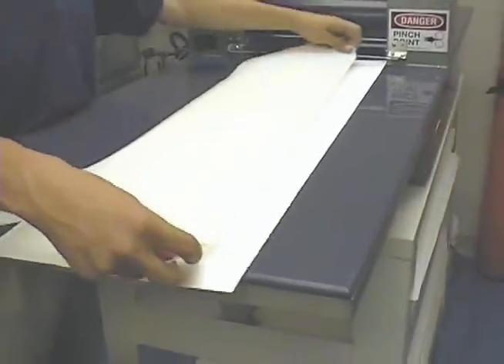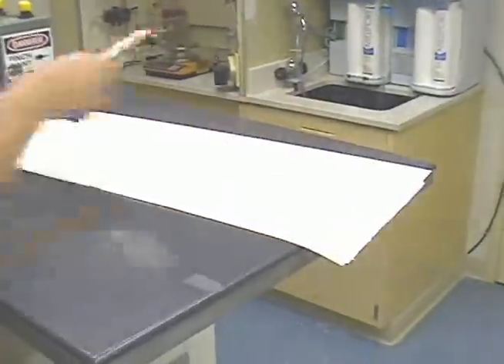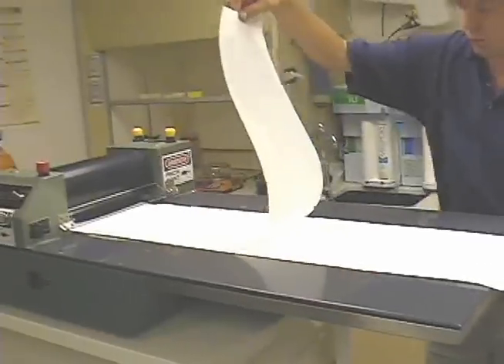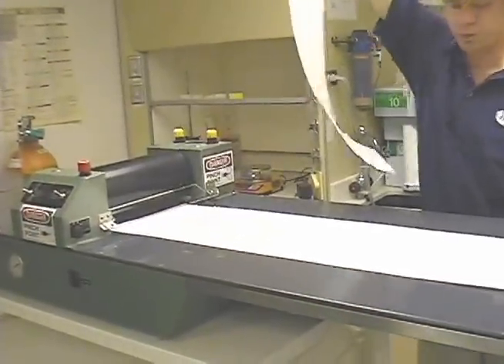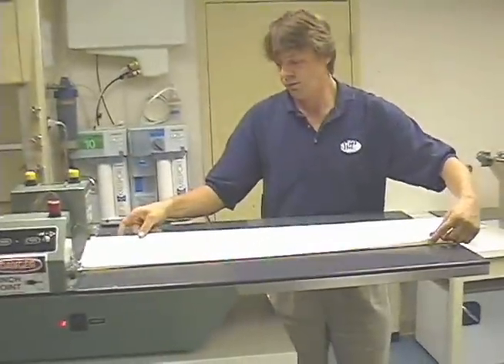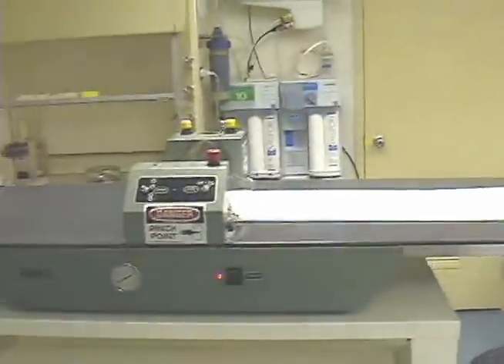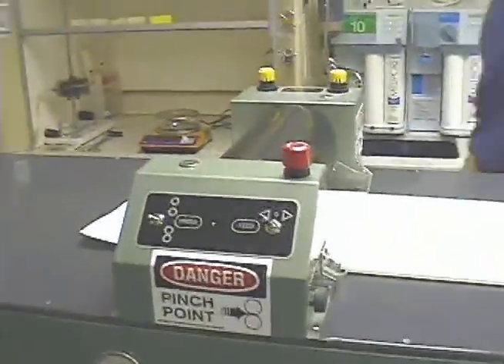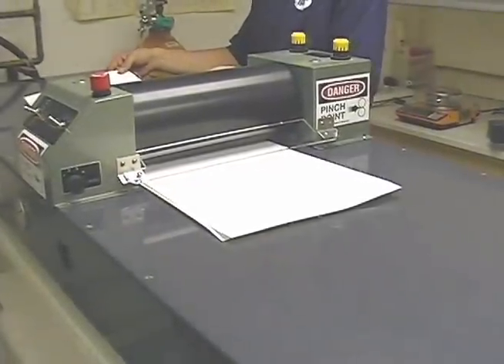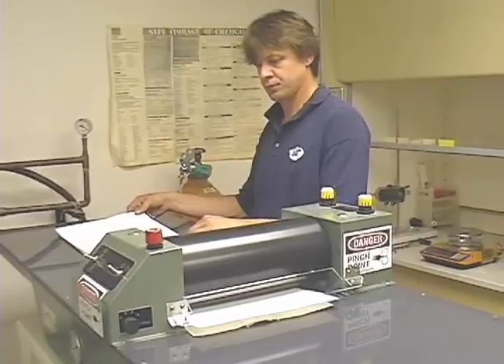Now we have a formed sheet on the wire. Subsequent pressing and drying of the sheet can be done in many ways to achieve a desired product. The Campa sheet press is a very convenient and user-friendly device, specifically designed for pressing the long sheets produced by the ADSF. The press is easy to use and safe to operate. The press features include four selectable pressing speeds and two selectable pressing forces, which can be independently adjusted. Large working surfaces on each side of the rollers provide a convenient working area to prepare the sheet for pressing. The press is bench-mounted to conserve laboratory space.